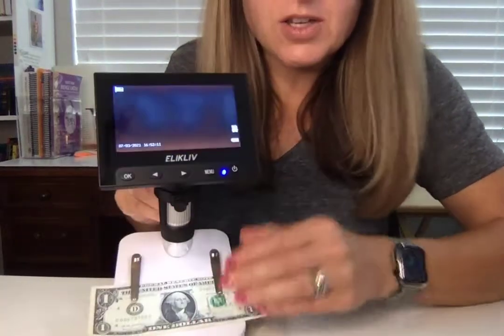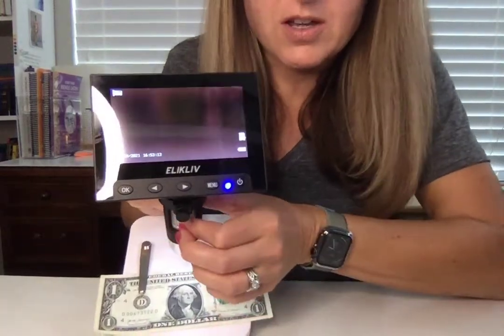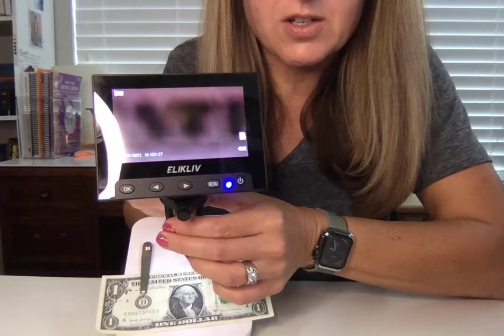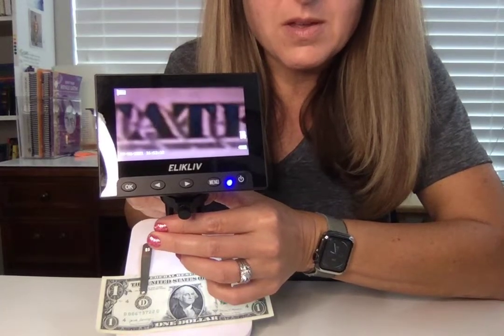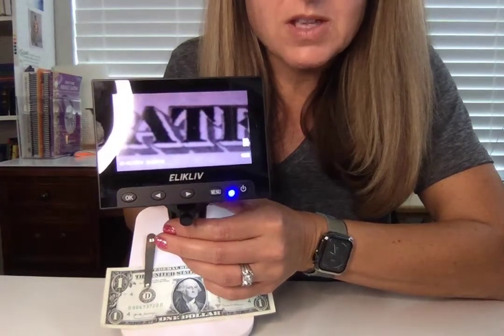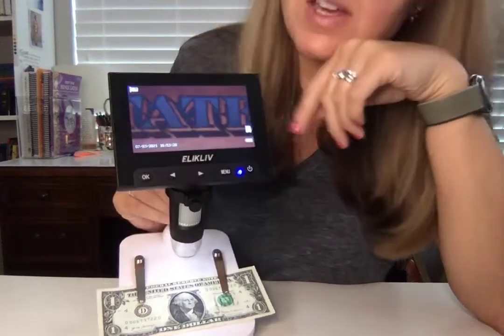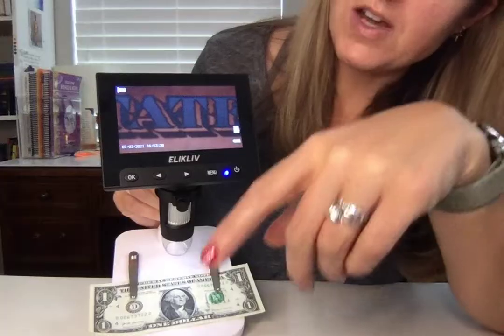It's just so fun to look at everything on a digital screen, and more than one person can look at the same time. There it comes into focus. You can also use an SD card to actually save some of the images that you capture.